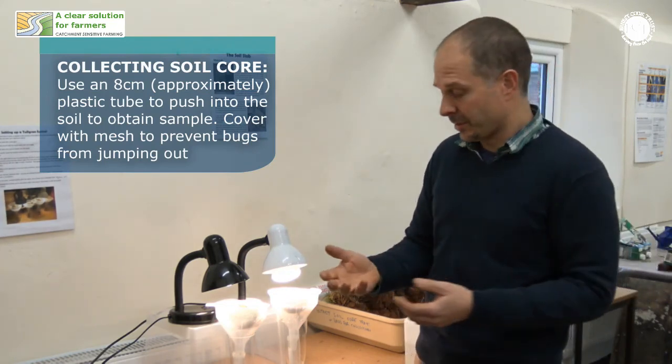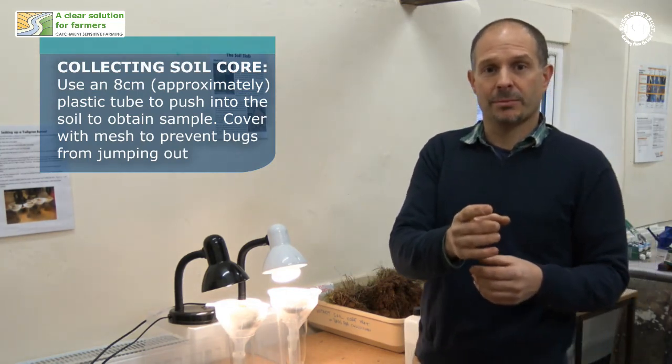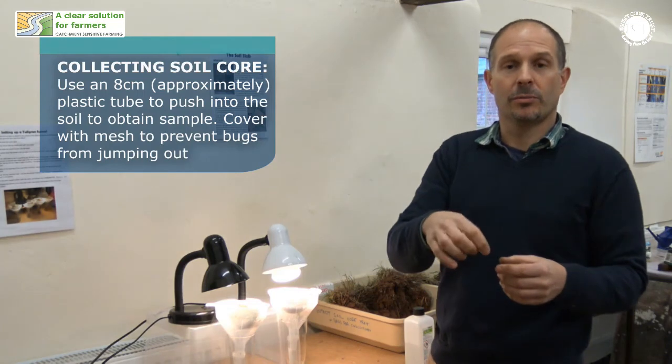Because some of these creatures can jump — certainly the springtails — having a piece of net curtain over the top, or fine net mesh, just taped over the top, will stop the bigger ones from escaping while you're sampling your soil.